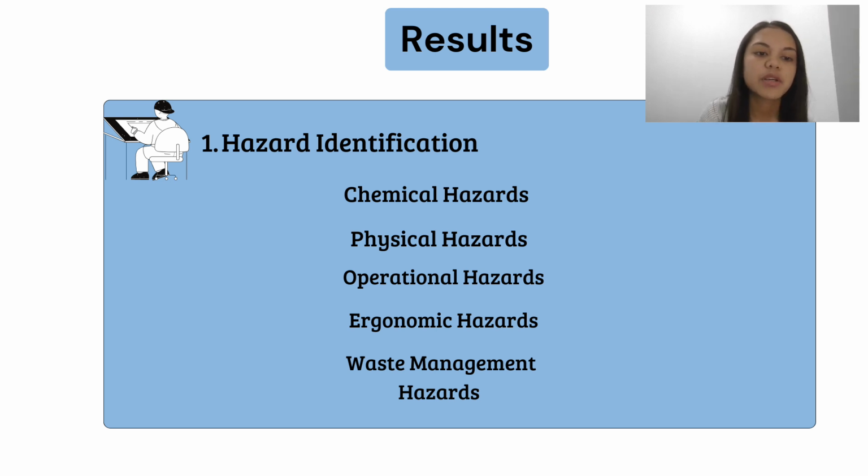For the chemical hazard, the source of the hazard is from making chemical solutions, like fumes or spills, and direct touch when mixing or baking. The control measures are to put on PPE such as goggles and gloves, make sure there is adequate ventilation such as a fume hood, and observe SOPs when handling the chemicals.